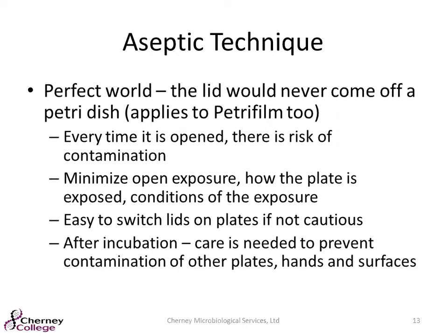so that it's just the sample in there. For anybody that does use Petri dishes, it can be very easy to switch the lids if you're not watching what you're doing. So make sure that you have good documentation on your plates and your process, so that if I plate sample A, that's the one that is labeled A. And then after incubation, know that those plates are filled with bacteria. So take care when reading those plates, handling those plates, and disposing of those plates. And then again, good cleaning practices for hands and any of the surfaces that you've been using.